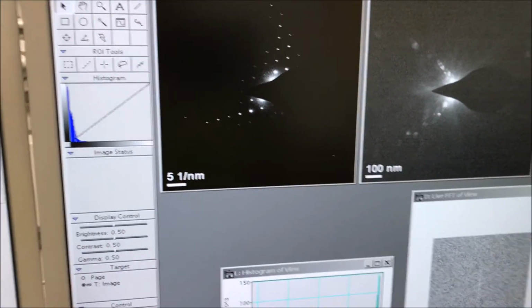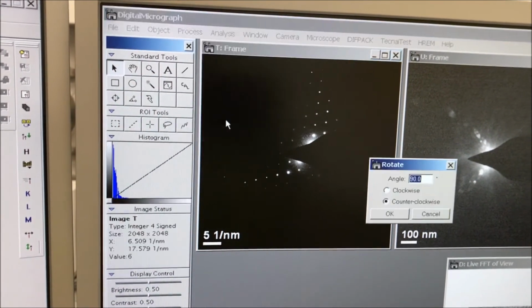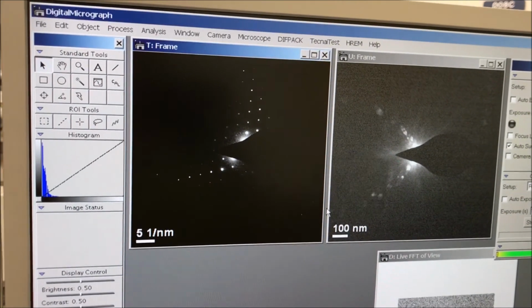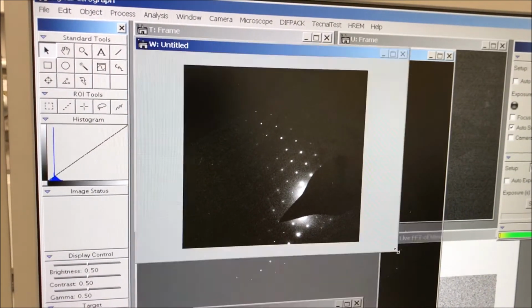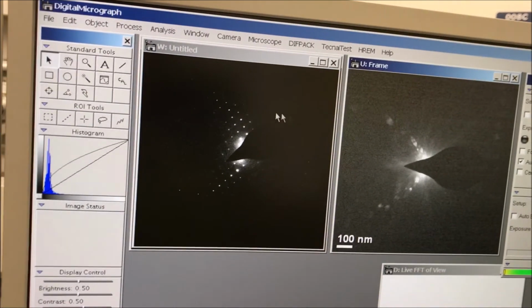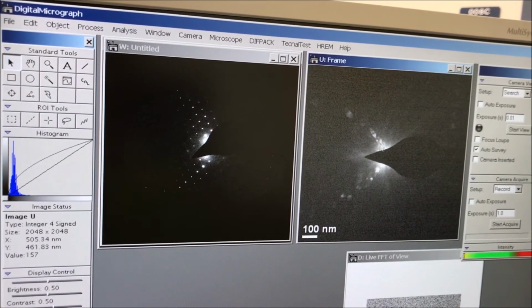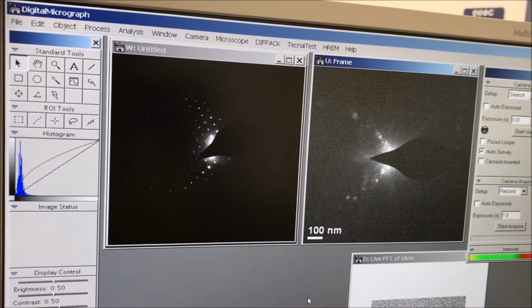So we can see now that again, if I do a rotation of the pattern 30 degrees counterclockwise, I end up with the pattern oriented correctly. So it turns out that our initial guesses between our two possible angles were indeed correct. And they just happened to be that way. We could have picked the other ones and then found out we were wrong, but we didn't.